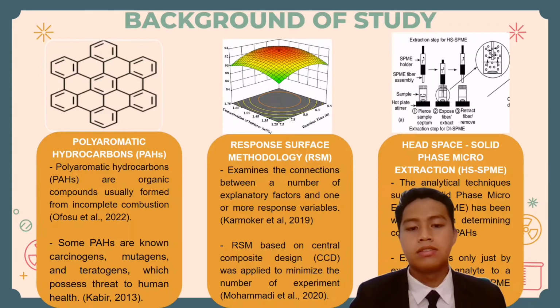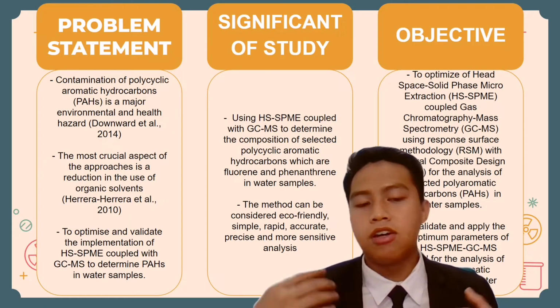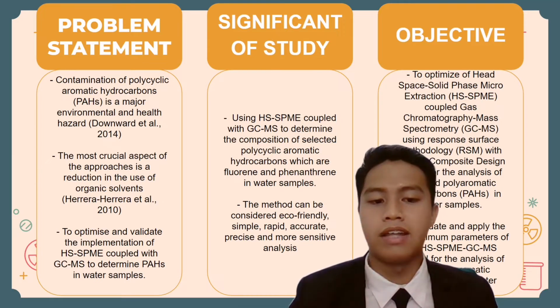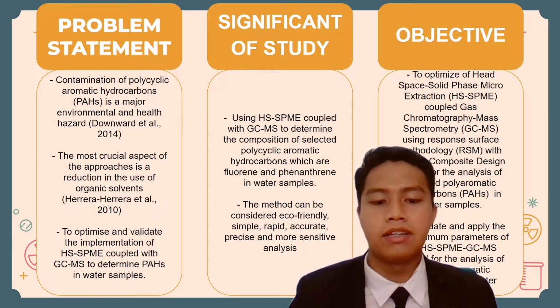of my study. The background of my study is that I have studied polyaromatic hydrocarbons, response surface methodology (RSM), and headspace solid phase microextraction, which is HS-SPME. I have stated in my problem statement that the contamination of polycyclic aromatic hydrocarbons, which is PAH, is a major environmental health hazard. Thus, an optimized technique needs to be used in order to analyze the greatest concentration of PAH.